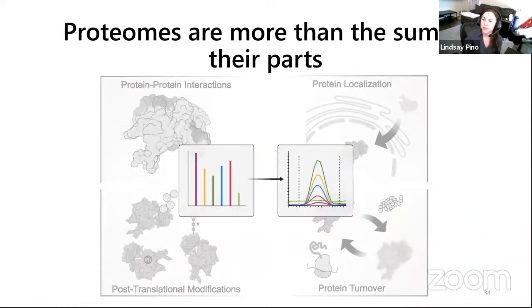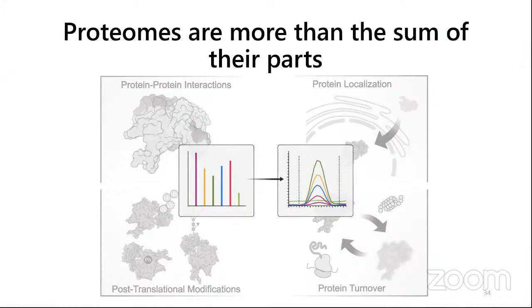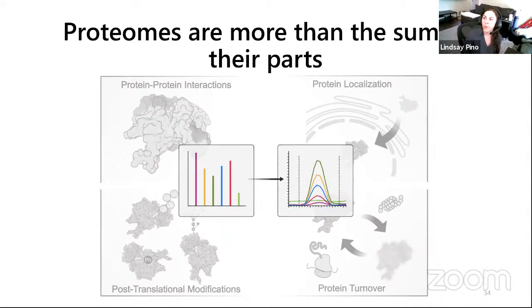So I'll stop again for questions, but it looks like the TAs have done a pretty good job. There was a question about the low glucose conditions. They were exposed to low glucose for roughly 24 hours. I tried to control for growth rate and harvest so that the population doublings were about the same for each, so the time was a little different for each of them.